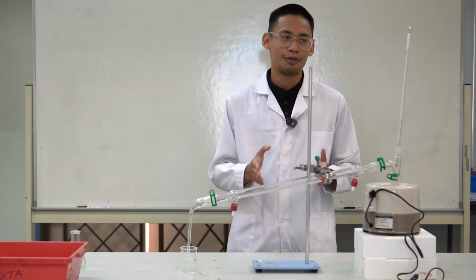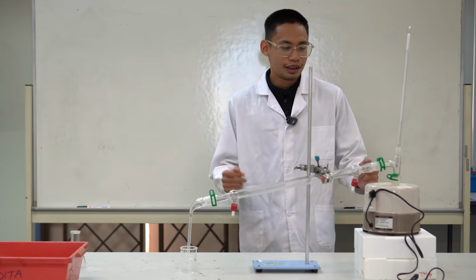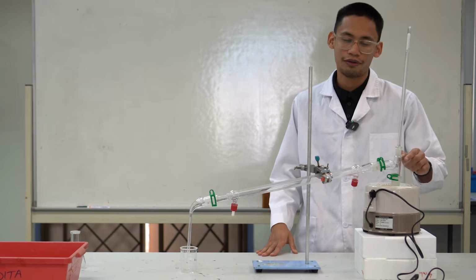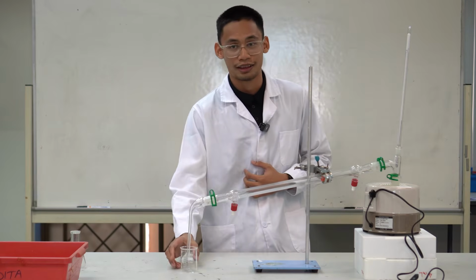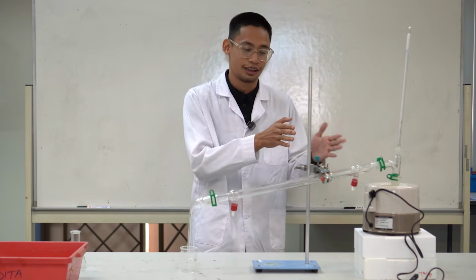For my part, I will be explaining the apparatus that we use and the general procedure of distillation. As you can see here, we call it simple distillation. We have a heat mantle, round bottom flask, distillation head, thermometer, condenser, and receiving flask. For each apparatus, I will explain the function after this.